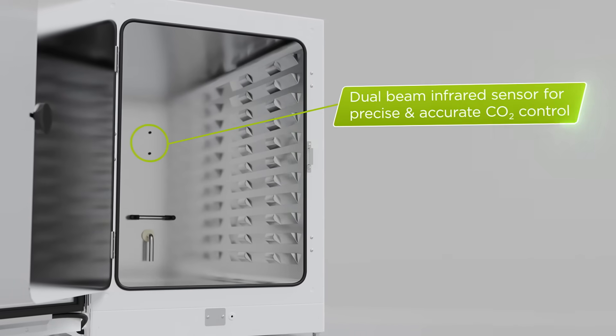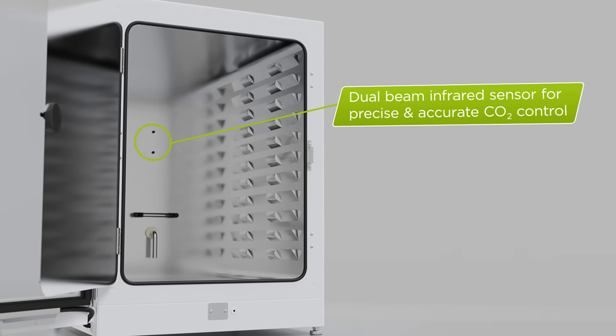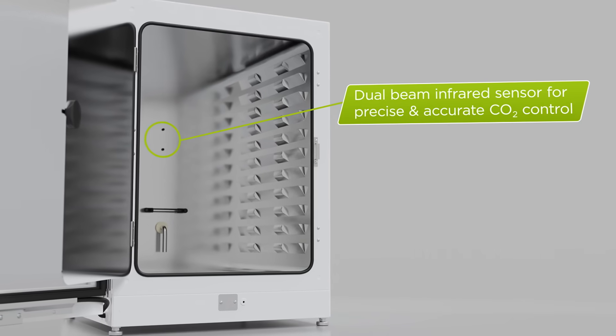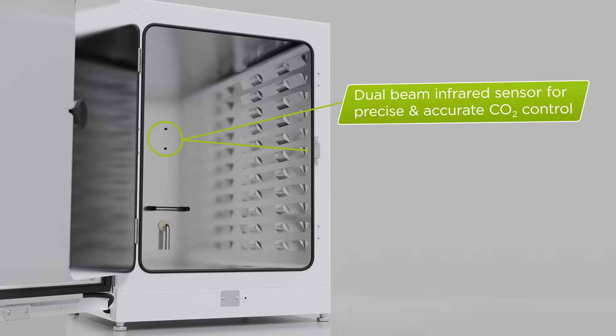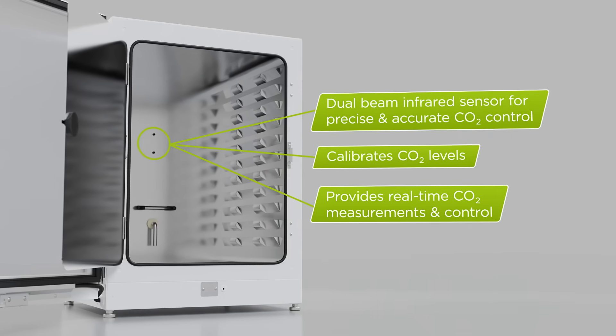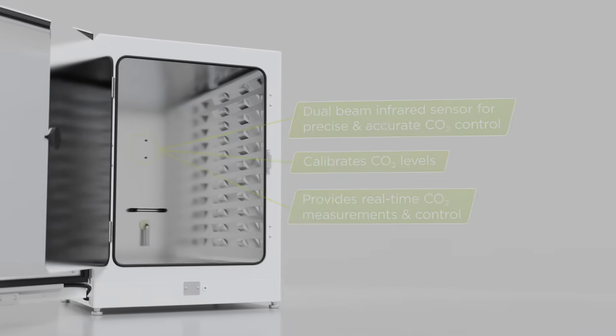Incusafe features a dual-beam infrared sensor that utilizes two filters to deliver precise and accurate CO2 control. This additional light filter allows the system to calibrate CO2 levels continuously while providing real-time CO2 density measurements and control.